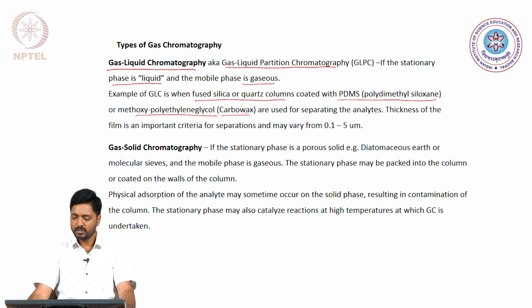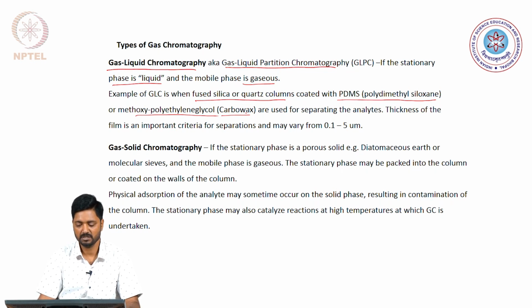The thickness of this film is a very important point to be kept in mind while undertaking the separations, and indeed commercial columns with thickness variation of 0.1 to 5 microns are available.